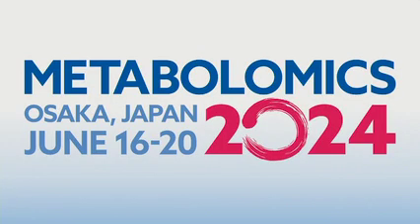Hi. So my question is about MSE data from Waters products. Is MZmine also able to process those kind of data? The short answer is it's not very well supported at the moment. A little bit longer answer is that we are working very hard on having it supported, because there are many people who are using these MSE or data-independent workflows. So yes.